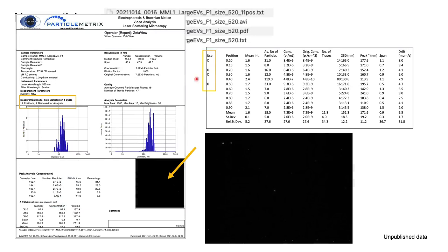If you look at the text file, the machine counted only four positions out of 11. So I suggest you repeat the analysis because it's not going well.